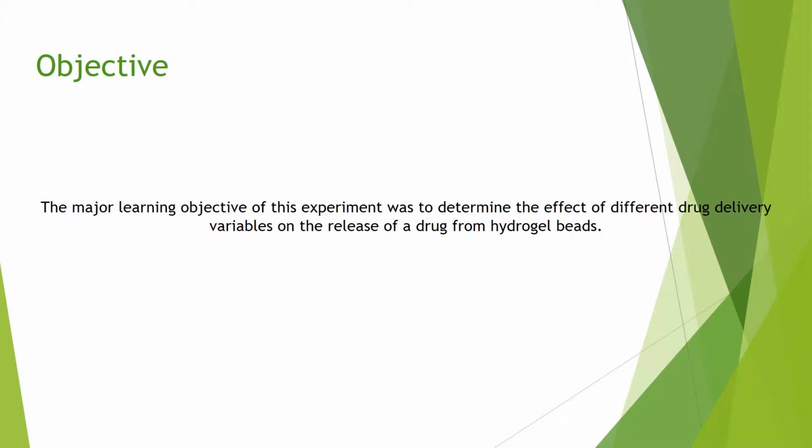The major learning objective of this experiment was to determine the effect of different drug delivery variables on the release of a drug from hydrogel beads. With a dye called tartrazine along with beakers of water, we simulated the release of a drug into the human body.